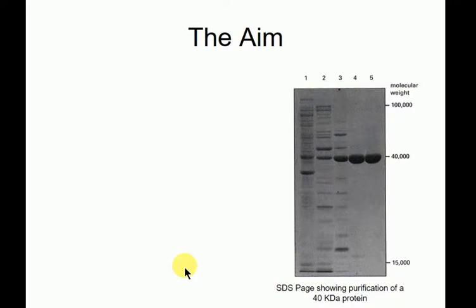Until you come to purify a protein yourself, you don't quite realize how much biological material sticks to what you have in the lab. Glassware, plasticware, unless you buy really expensive reagents, proteins, DNA, just stick to everything. And your biggest enemy is loss.